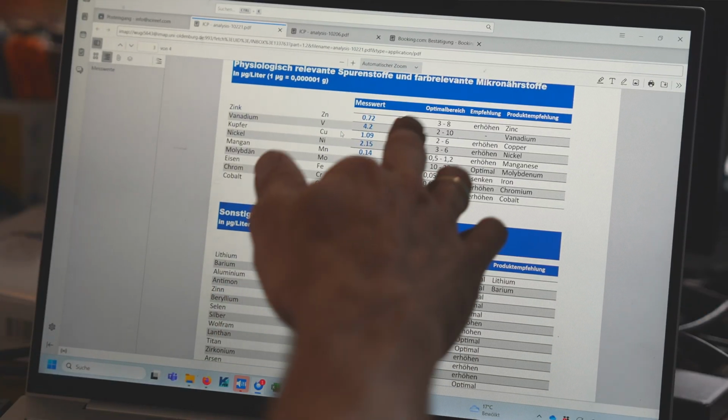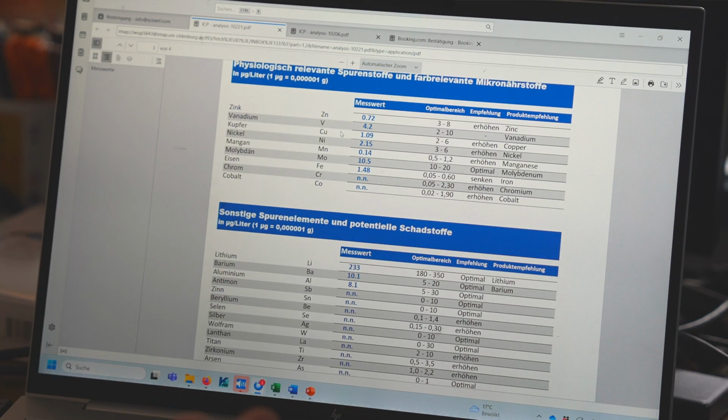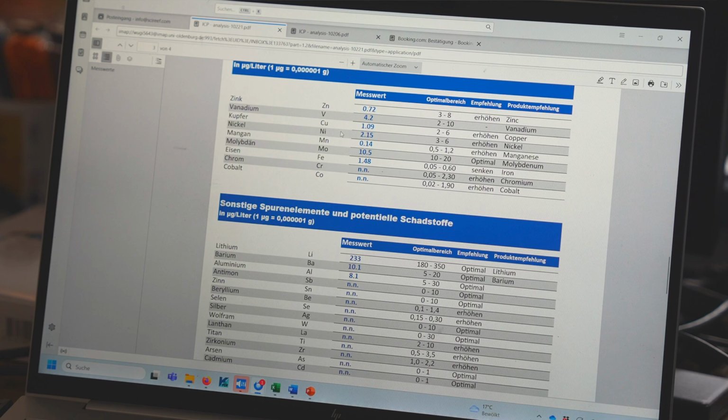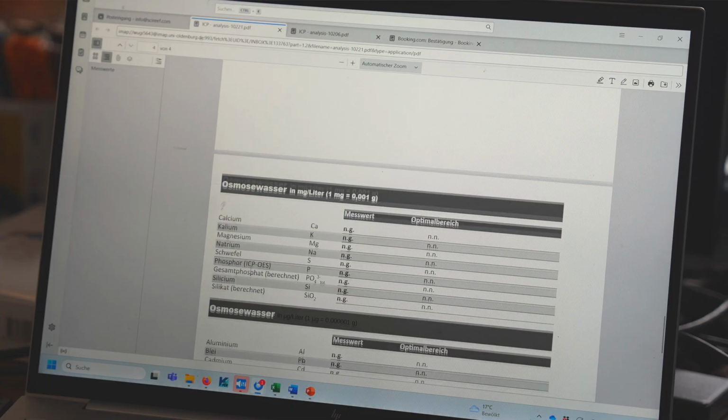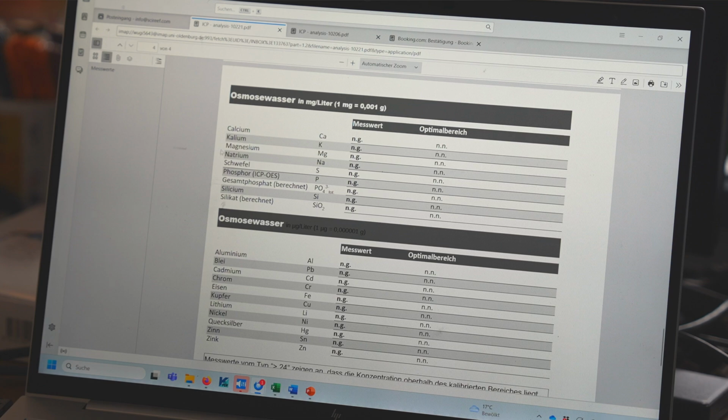You get, again, the recommended range of concentrations, and then a recommendation what to do. Should you add something? Should you try to lower certain values, etc. Then again, you have the other trace elements that can potentially be very toxic, like mercury, lead, cadmium, arsenic, all that. And then you also get the report for your RODI water. So they measure the macros, also nutrients, the phosphorus is being measured in the RODI analysis, and metals that you don't want to have in there or not in a critical concentration.